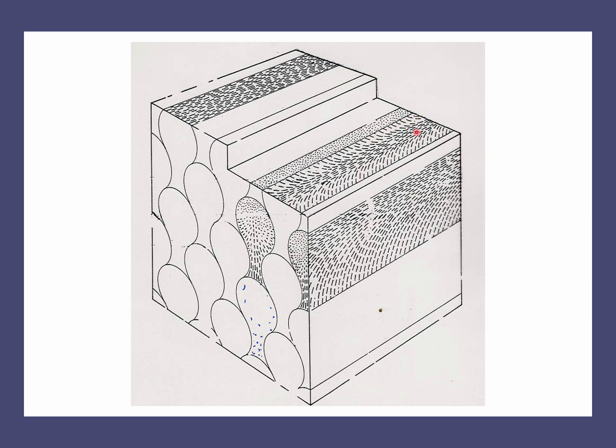This deviation gives us a difference in color between the edges of the keyhole pattern and the core of it. And we can see this in a lot of sections, longitudinal or across, always the sheath or the layer of the exterior of the keyhole is darker or more distinguished than the core of the head and the tail. We will see that in a minute.